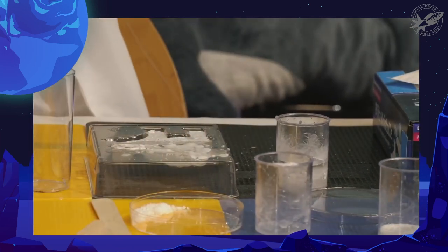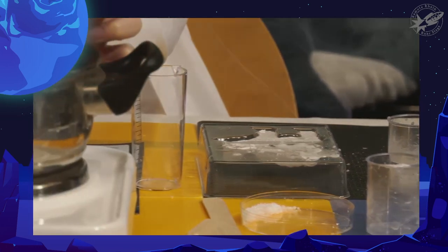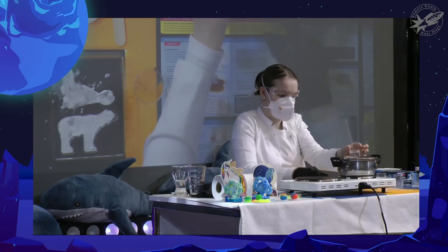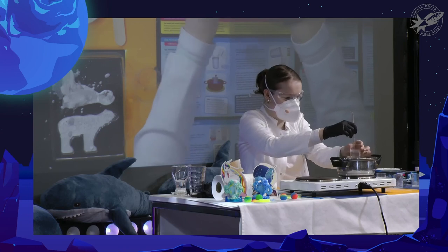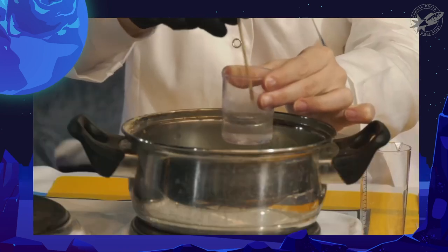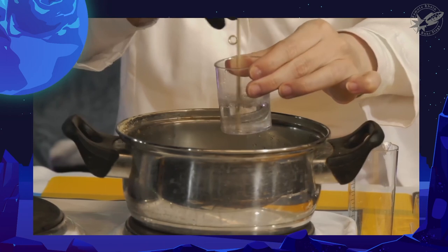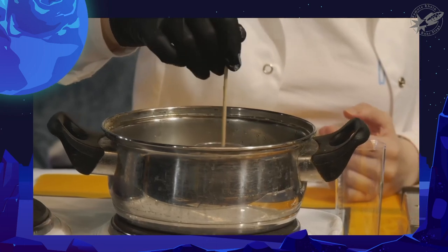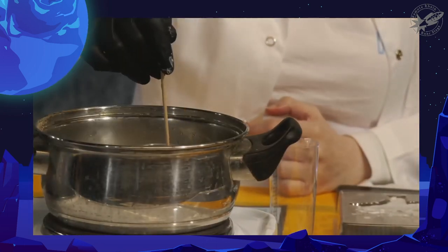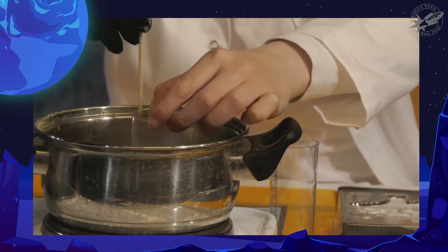But I can take a look at the last experiment I prepared here, since the other experiment I won't have time for. This is starting to dissolve. You have a few crystals at the bottom. I'm going to keep stirring to dissolve everything in here. The manual says something about 10 minutes, which doesn't seem to be fully accurate.